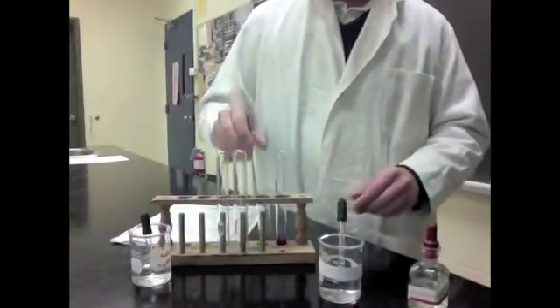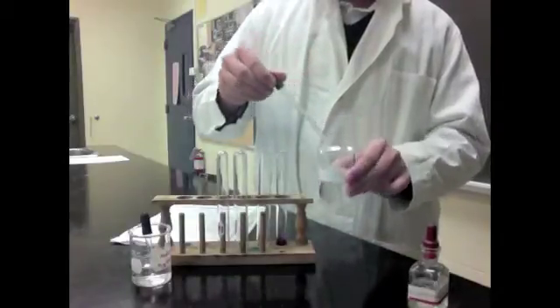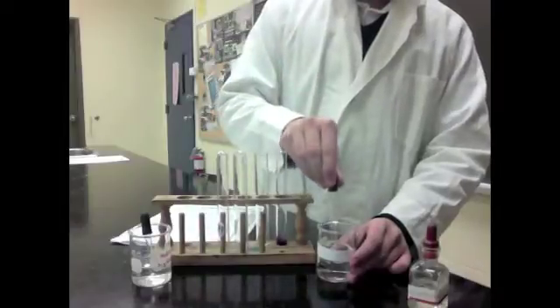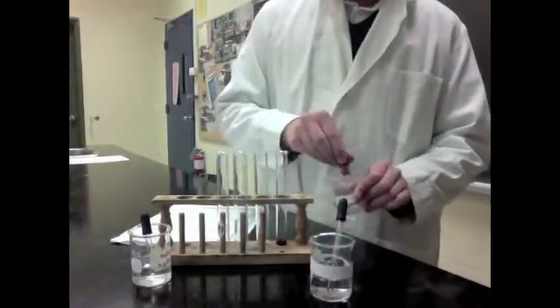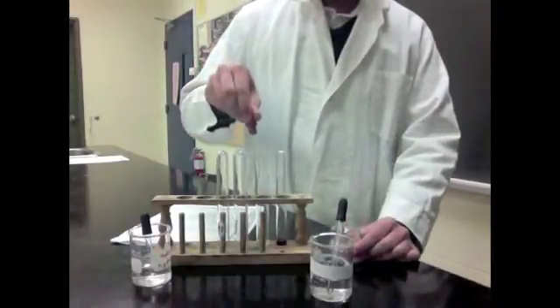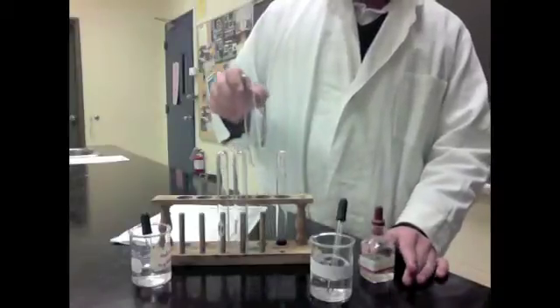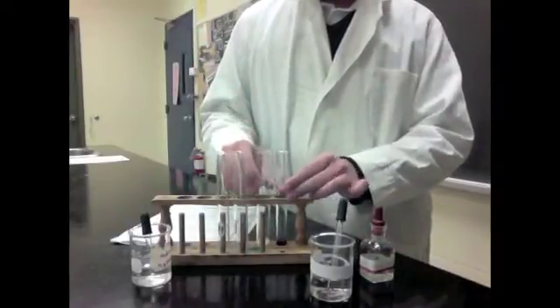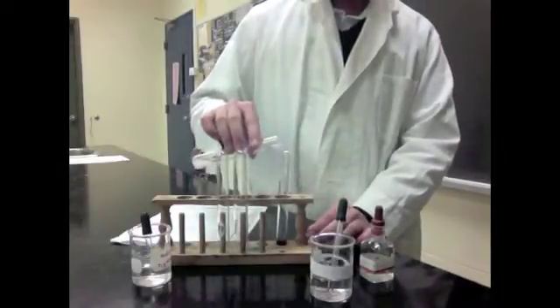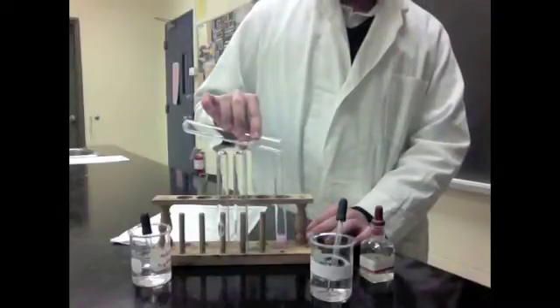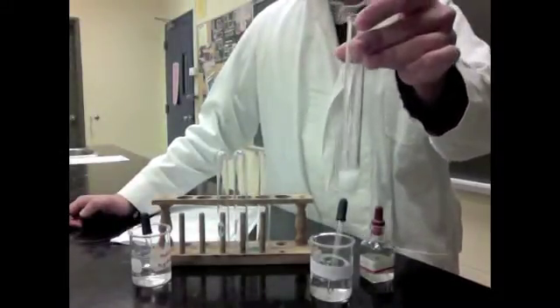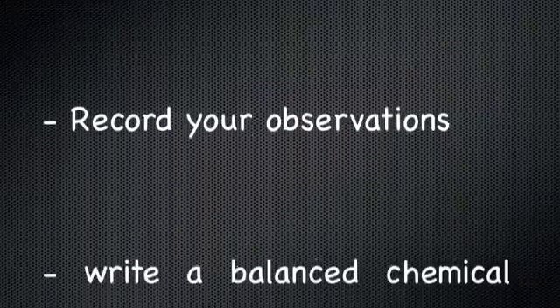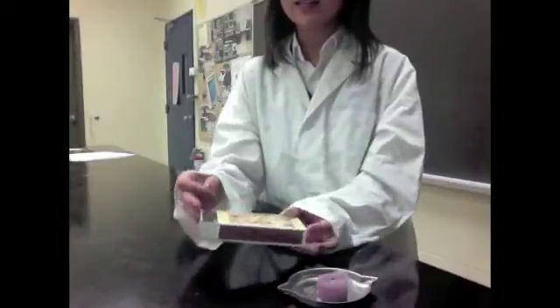Then you take another test tube and take some sulfuric acid, two eyedroppers of sulfuric acid, into the test tube. Then you take your phenolphthalein again and put it into a solution of sulfuric acid. Notice the effects of the phenolphthalein on the sulfuric acid. Next off, you will have to pour one of them into the other and record the results into your lab report. As you can see, it turns cloudy. Why does it do this?